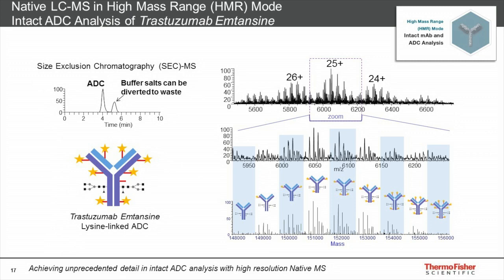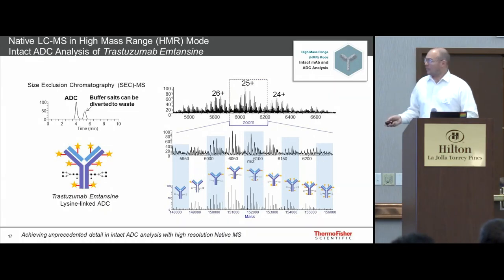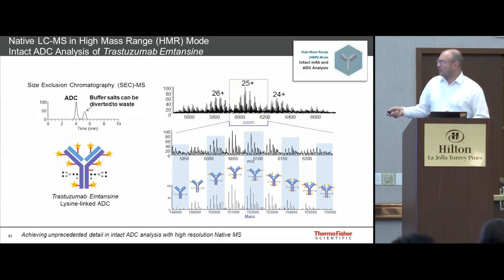The deconvolution software can achieve a better, closer to perfect result, and the analyst can also say, gosh, that looks pretty similar. Yep, I like it. It's good. Let's go. So the answer we get allows us to really pick into the data and make additional conclusions.